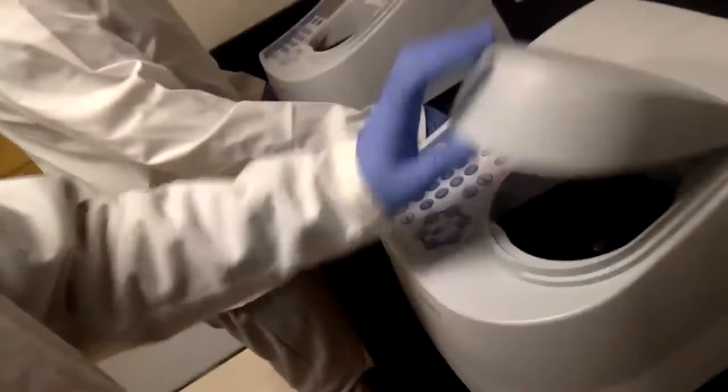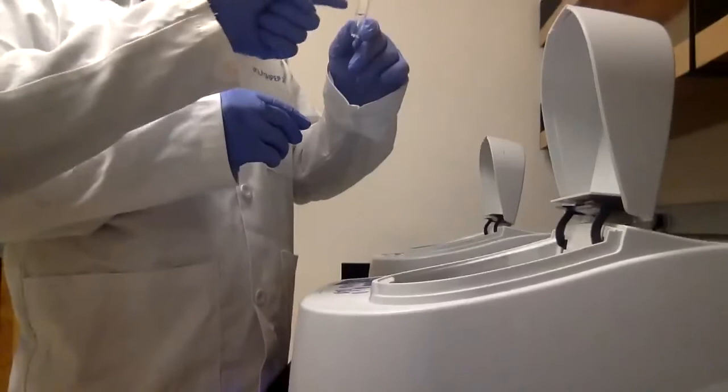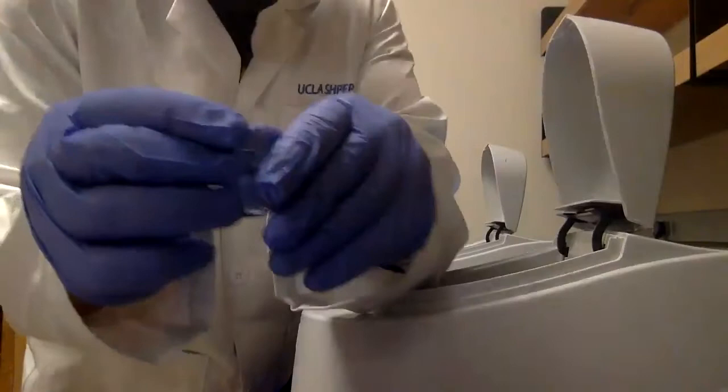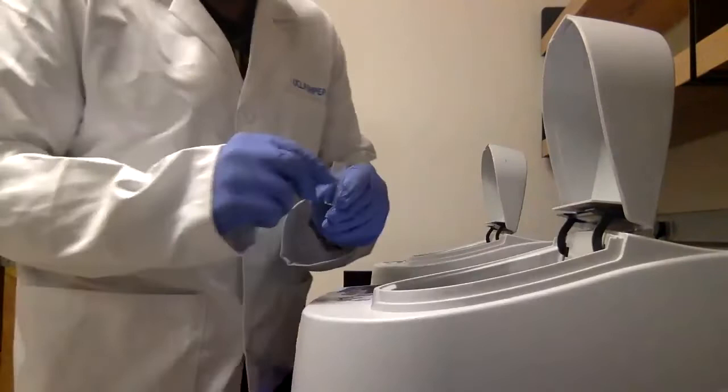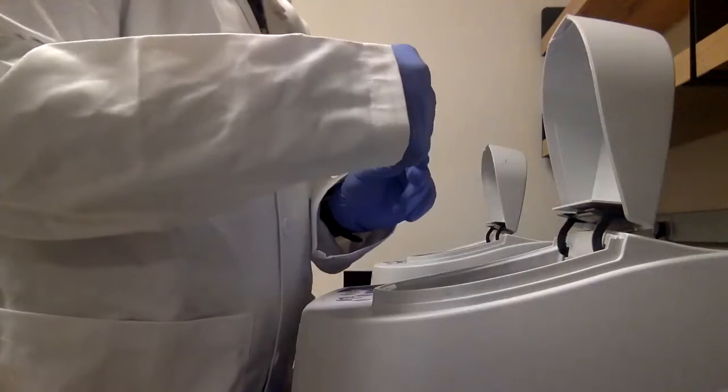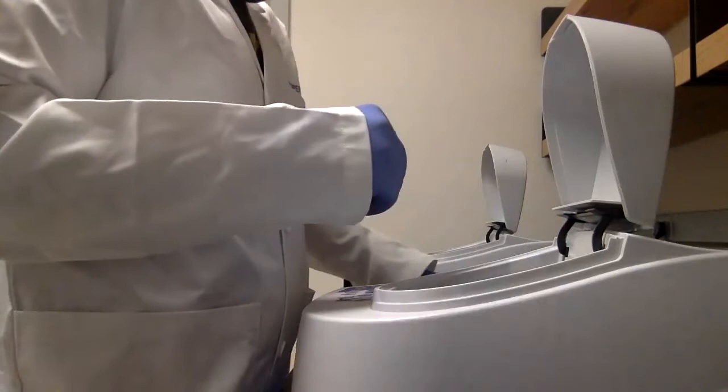Okay, now you put your samples into it, but make sure, before you measure it, you look at the top of the cuvette. Do you see the triangle over here? Show the students here. There's like a little groove, like a triangle. So make sure the triangle faces the direction of the light. So over here. You put the rest of the samples in the same manner.